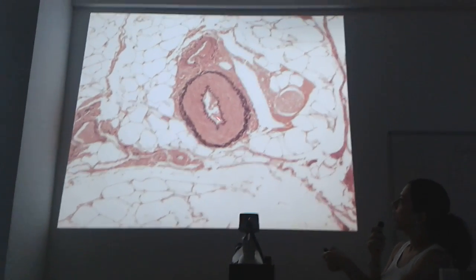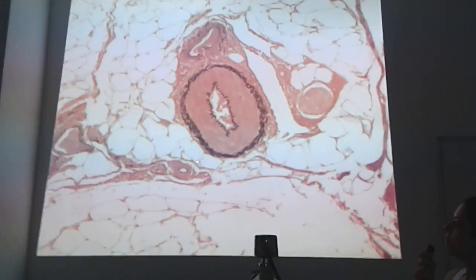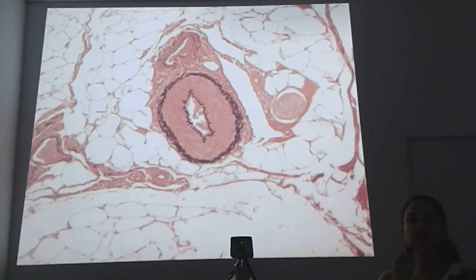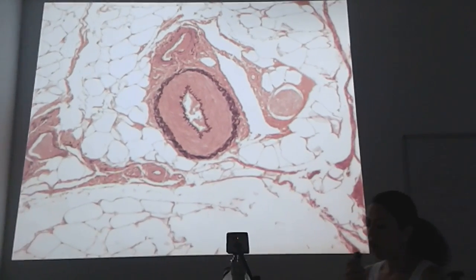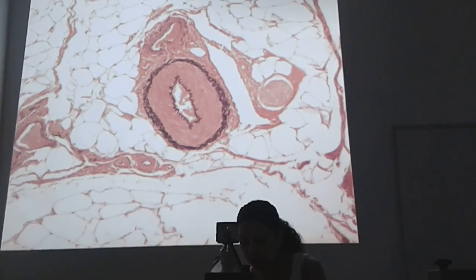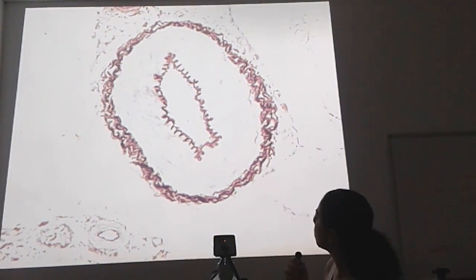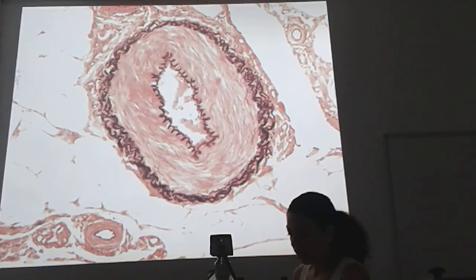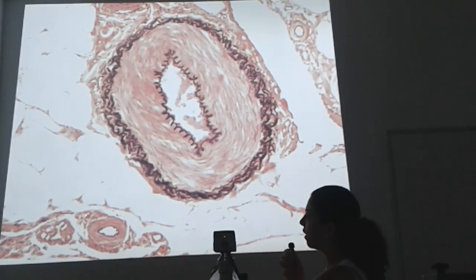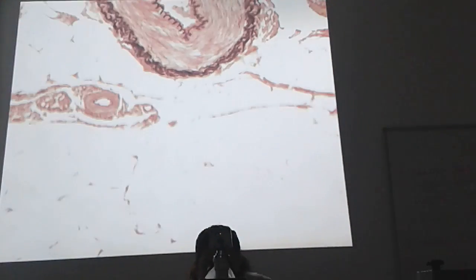At the lowest magnification of the slide, you will see structures like this, and these are vessels. All these are vessels. We will distinguish the vessels in our future lectures. But in this lecture, I want you to distinguish capillaries, which are lined by simple squamous epithelium. So I magnify my image, and the capillaries, the structures that I'm going to find, are here. So I'm going to further magnify my image.